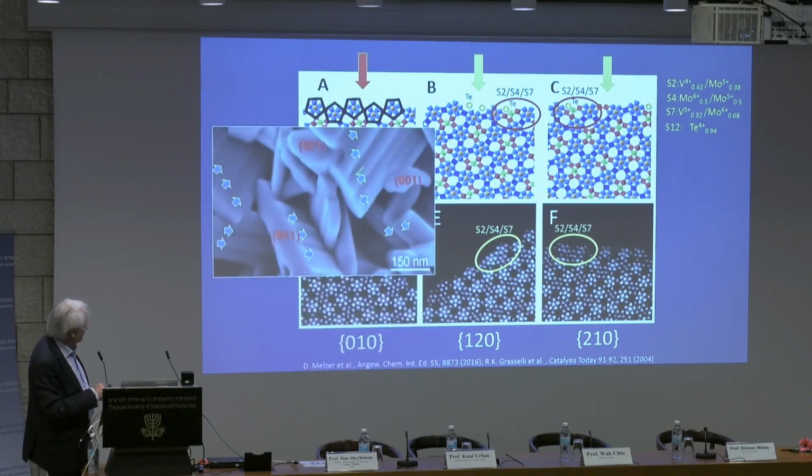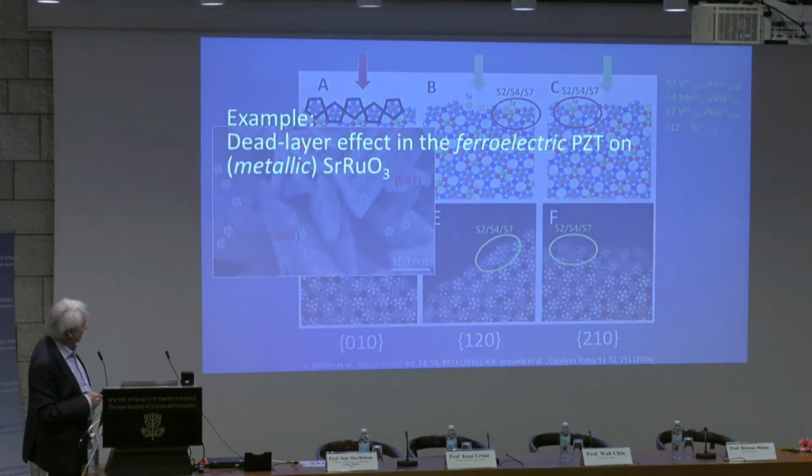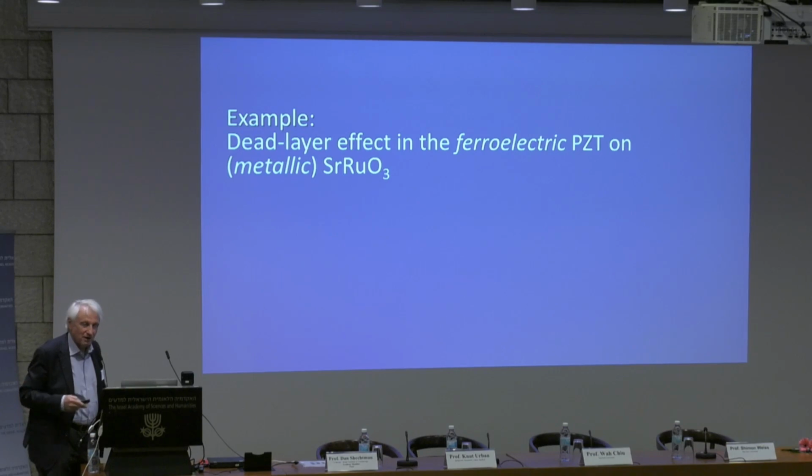That means these arrows here are areas where we have a very intensive catalytic activity. So this takes place here as well, but nevertheless, they are forming mainly the catalytically active site. So that's the type of information you can get from electron microscopy.